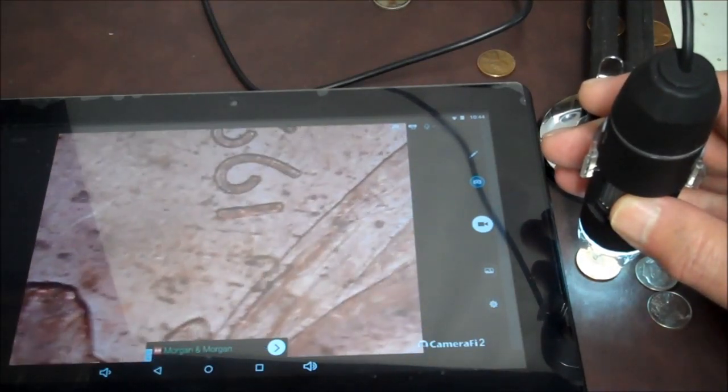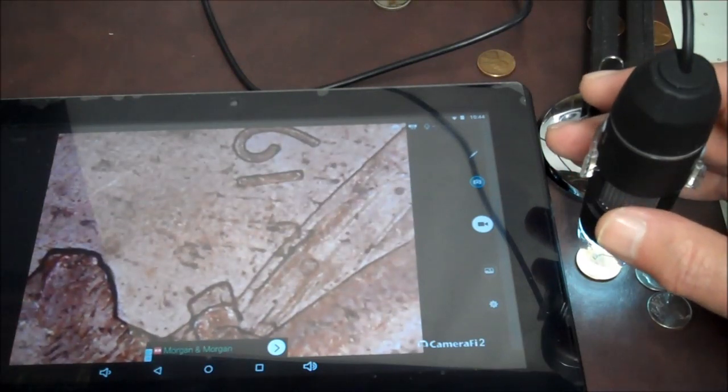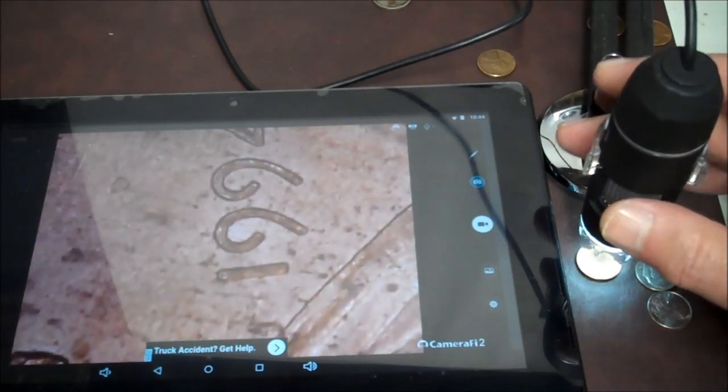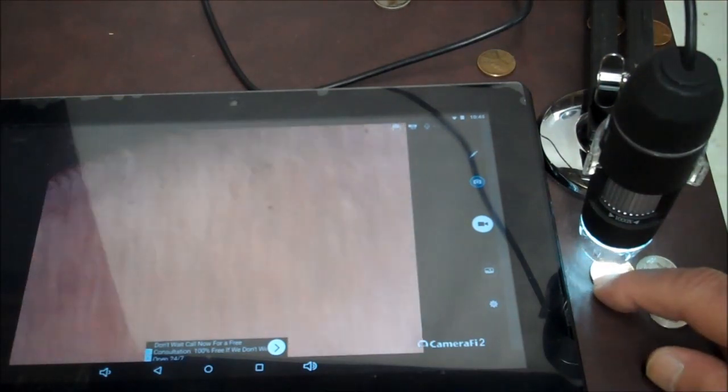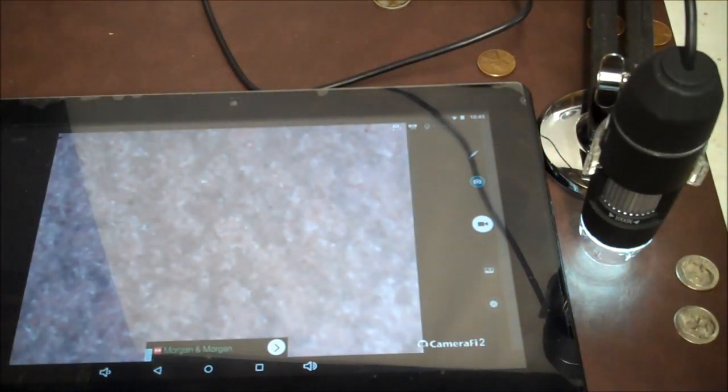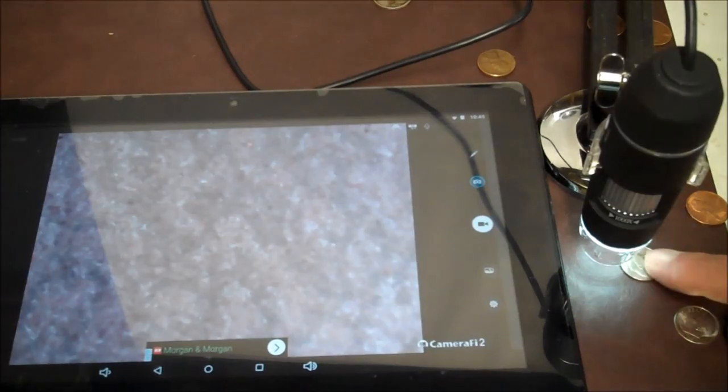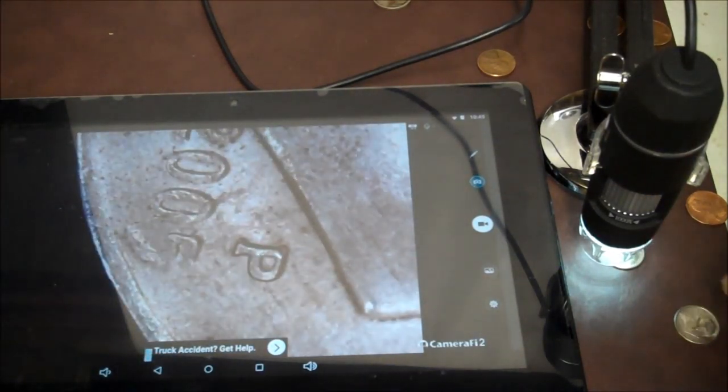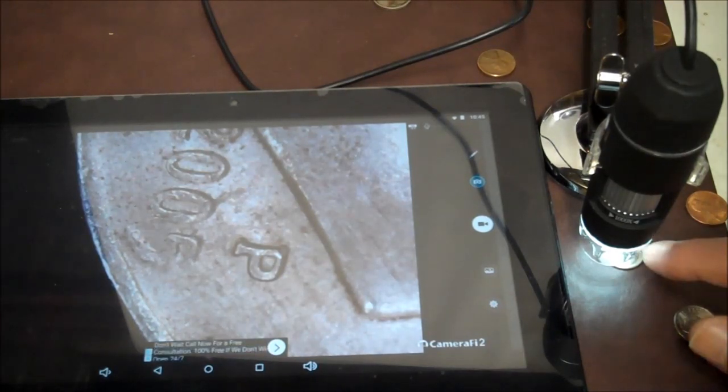Make it easier. You can see it's coming into focus, focus right there. Okay, now, once you get it focused, you can just leave it alone. And then maybe you can move in whatever you want it to look at. So, say I wanted to move in this dime. See, it's already focused. I don't have to touch it again.